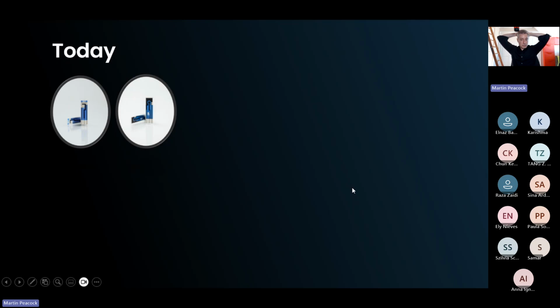So today we've talked about screen-printed electrodes. I did have some live questions coming through. I can see a long question being written, but it keeps disappearing on me. Somebody was just asking if I recommend cleaning the sensors before use. When we're trying to make biosensors at Zimmer & Peacock, we've got this manufacturing process where we take screen-printed electrodes, we clean them, we then functionalize them. So I would actually say that it is a good idea to have a cleaning step in there.